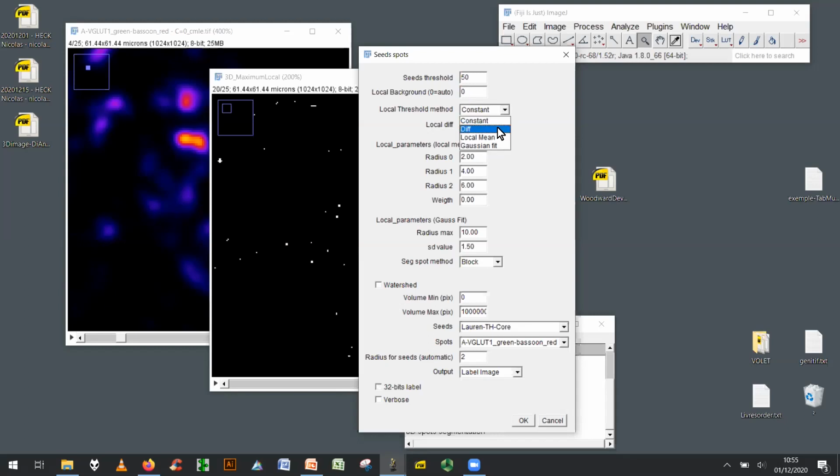Then you have another possibility, which is local differential, which you can set here. Local mean, which is here. In the case of local mean, you would also look at the intensity around the maxima, but only within a 3 radius, and you would give a weight to each. And the one I propose you explore is a Gaussian fit, which is a kind of most advanced mode, I would say. And Thomas will stop me anytime I make any mistakes. Oh, sounds good. Perfect.